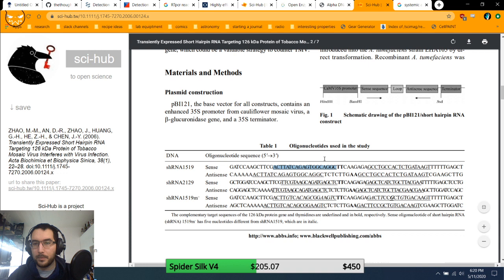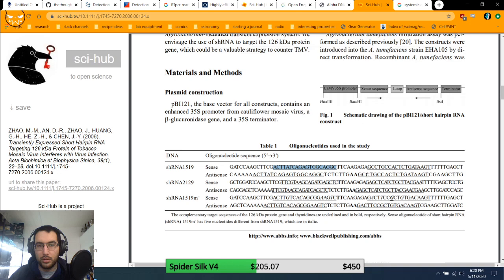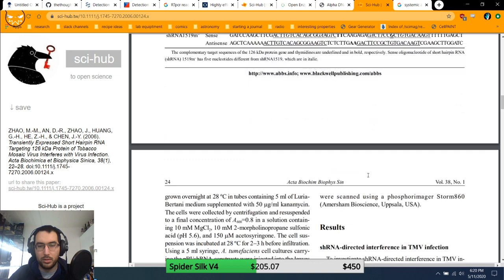Okay, sense, loop, anti-sense, terminator. Why are these so large? I don't understand. Why is this so big? Okay, wait, there's a... okay, the complement, okay, yes, fine.